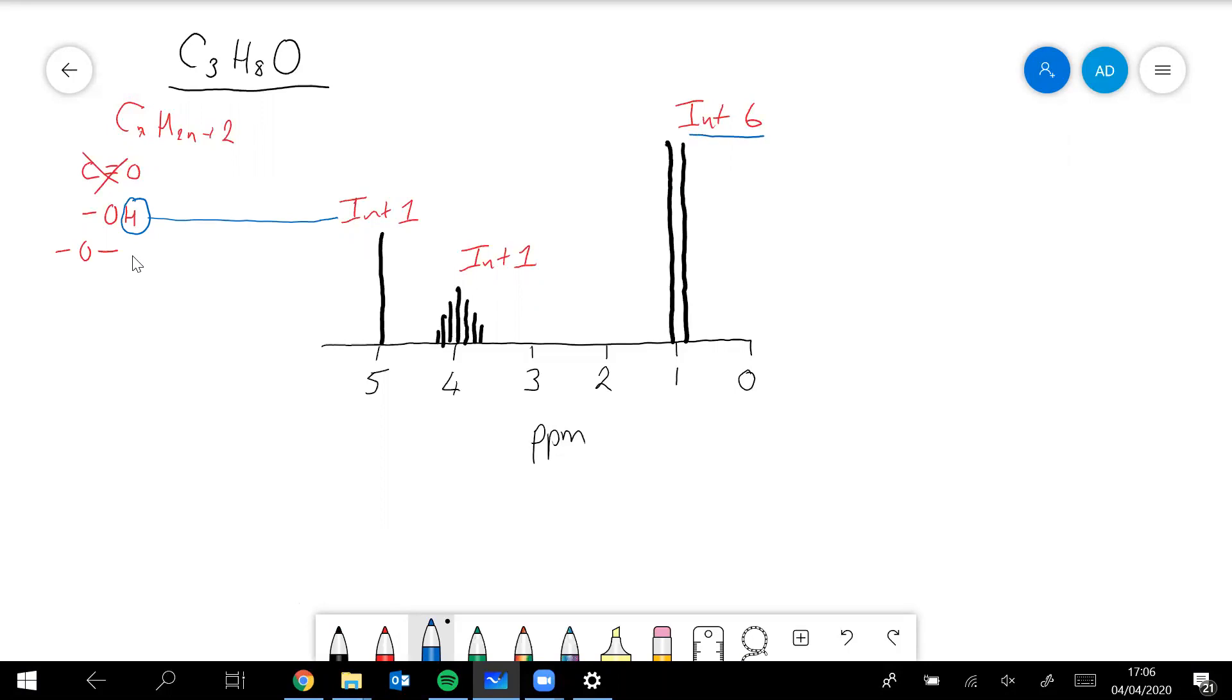Another thing which might strike you as a little bit odd here is this peak here which has got an integrated value of six, so you've got six hydrogens in the same environment as each other.